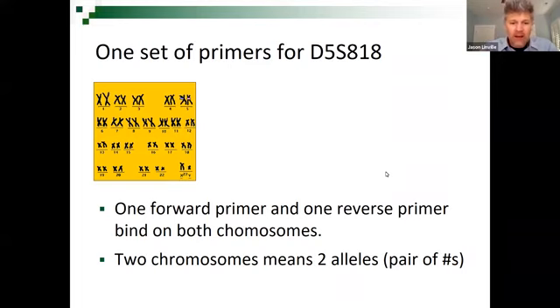Well, number one, in all these reactions we're going to talk about, the polymerase is the same. It's Taq polymerase that we talked about on Wednesday of last week, or in a couple lectures ago, right? The dNTPs, the A, G, C, and T, they're going to be exactly the same. It doesn't matter what area of DNA you're amplifying. Those 2 things are going to be exactly the same.